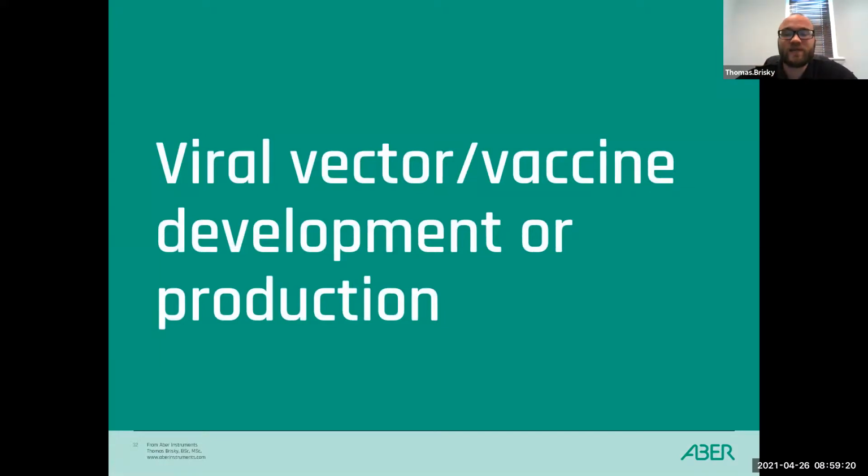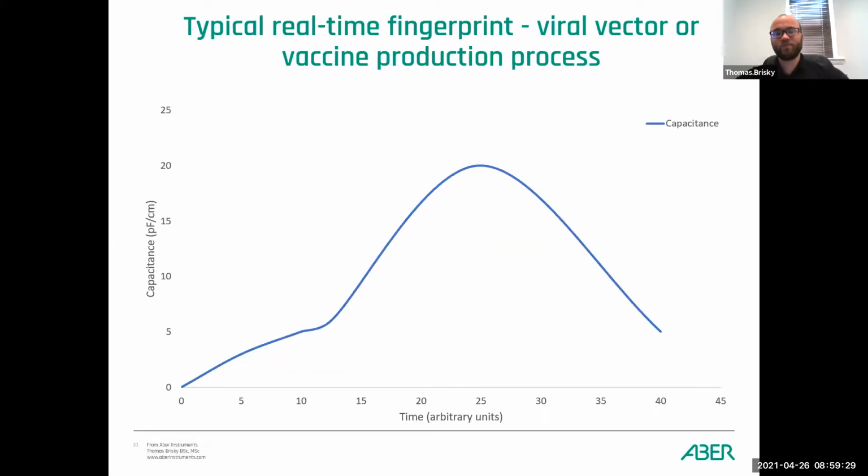So now let's take a look at some viral vector processes, as this seems to be the topic on everyone's mind at the moment. For a little background, viral vector processes are vital for creating genetic material used in many therapies, such as vaccines. The process involves using a host cell that becomes infected by a virus to heavily produce the material.